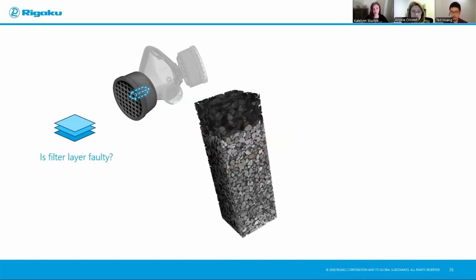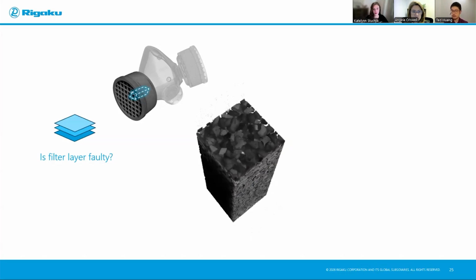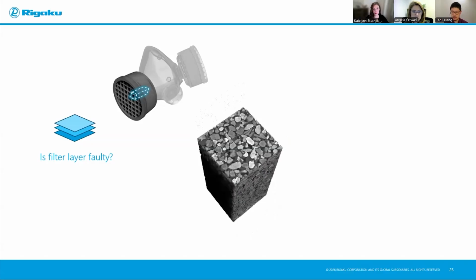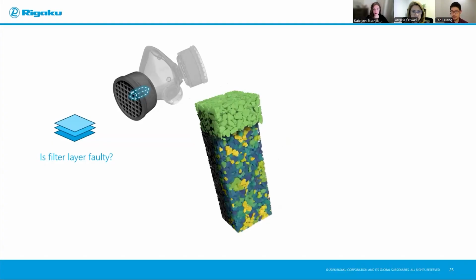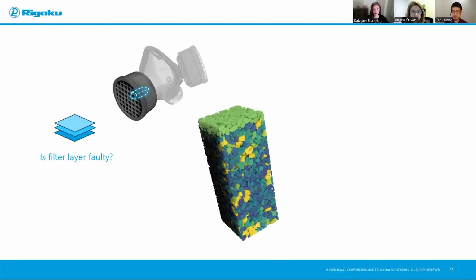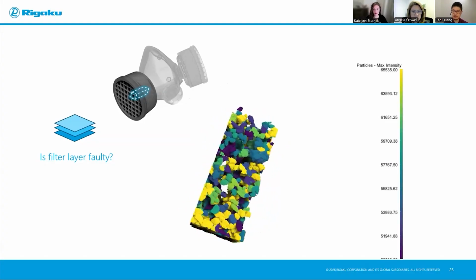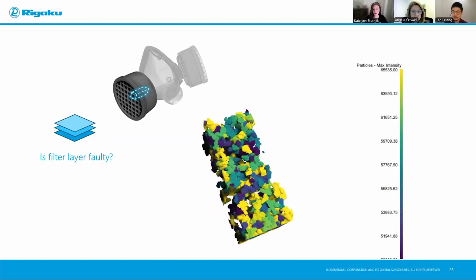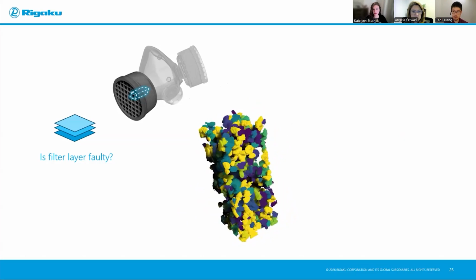We can look at everything in 3D. So in this case, let's separate the top layer, the lighter particles, highlighted here, segmentation in different colors. You can ask specific questions. But in this case, I was more interested in the higher density particles at the bottom. So this is the intensity distribution, because I noticed among them, there are also some intensity differences based on how dense they are. So in this case, I individually highlighted them just so I can do more analysis as a demonstration.